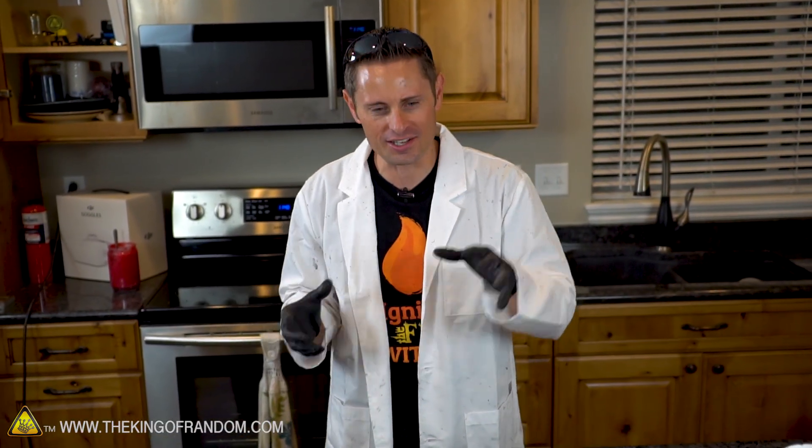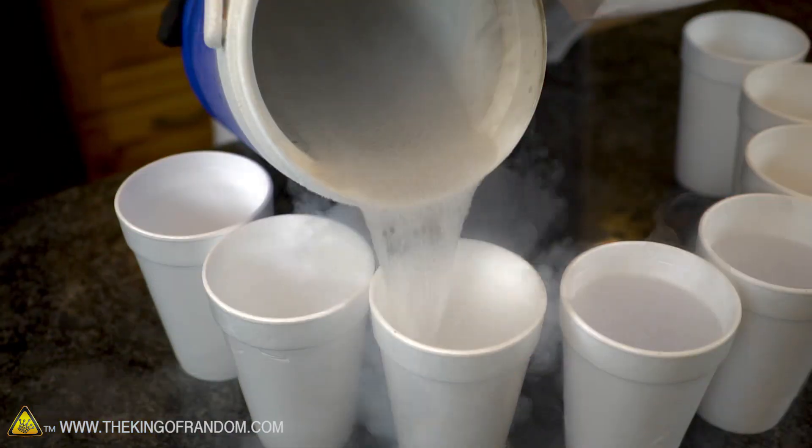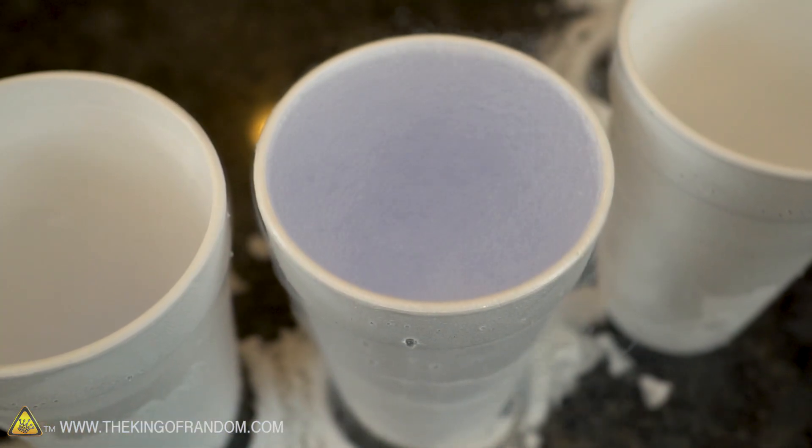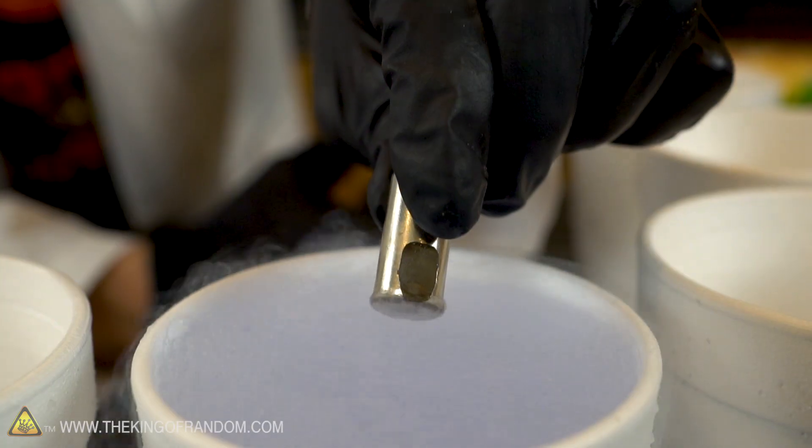So there you have it guys - that was incredible. And now you know how to use liquid nitrogen and styrofoam cups to make liquid oxygen right out of the air. We started off filling up eight cups with liquid nitrogen right to the top, then let them sit for about an hour until all the nitrogen had boiled off. But in the process of the nitrogen boiling off, the oxygen in the atmosphere condensed and was sucked into the cups. And when we mixed all eight of those cups together we had a cup overflowing of blue liquid oxygen.